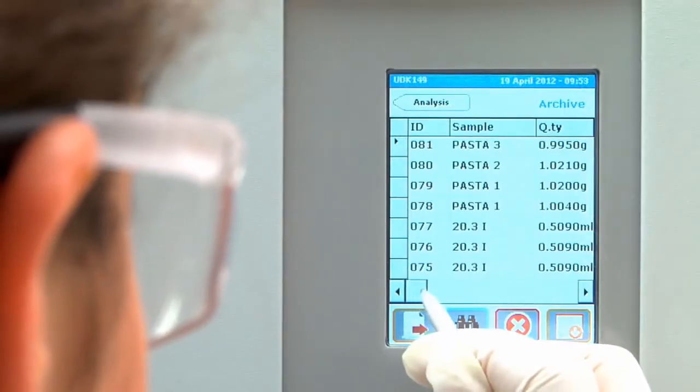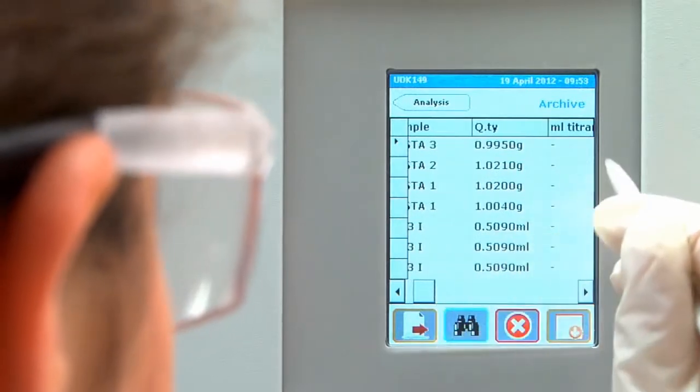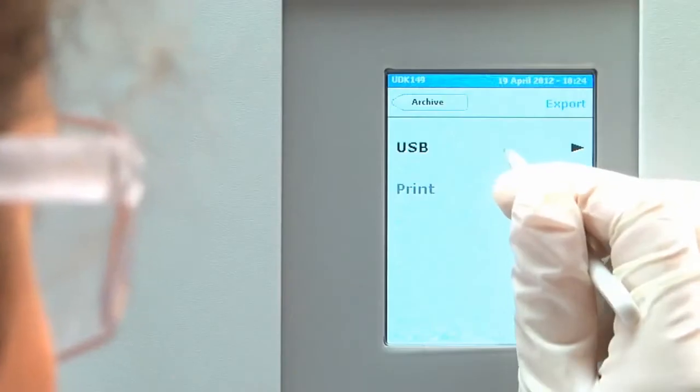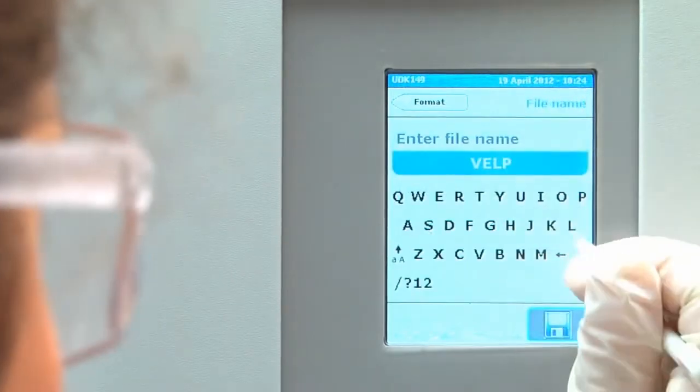After the analysis, all the results are shown on the display and stored on the onboard archive for improved operation and traceability in accordance with GLP.